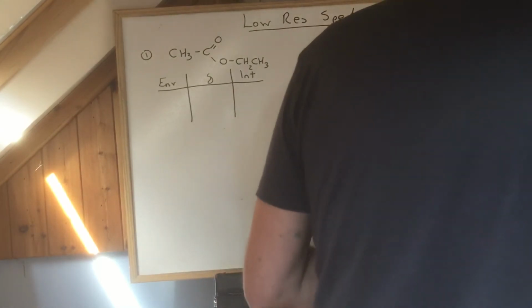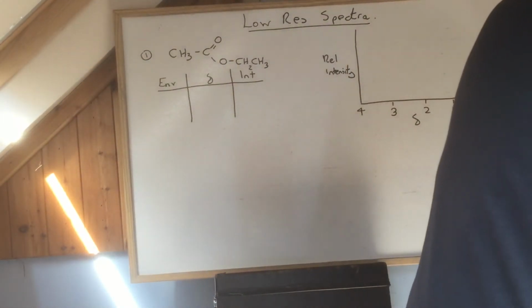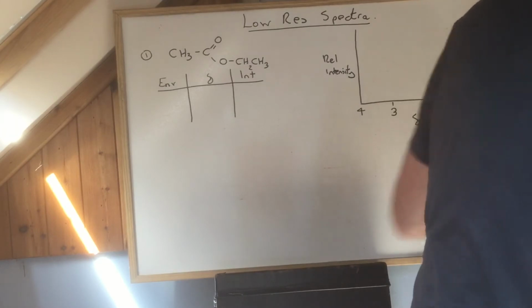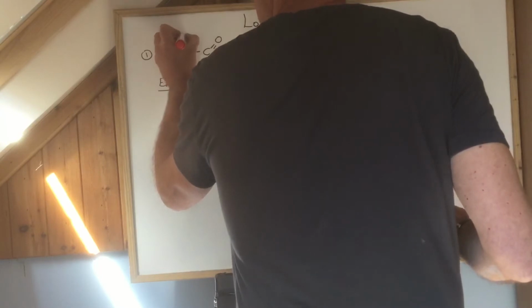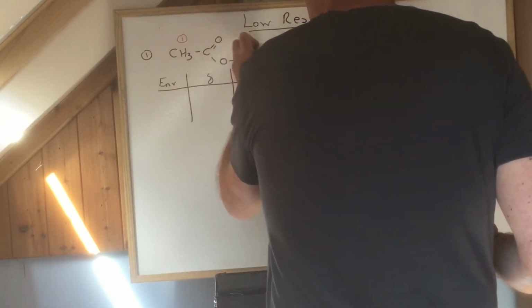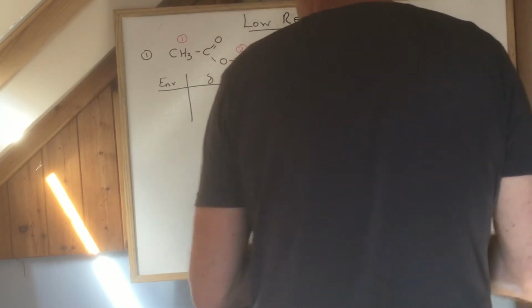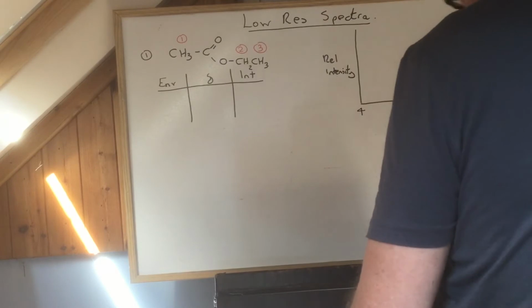Right, environment, let's have a look. How many different environments have I got? I've got environment 1, there's 3 protons in that environment. I've got environment 2, there's 2 protons in that environment. I've got environment 3, there's 3 protons in that environment. No problem at all.